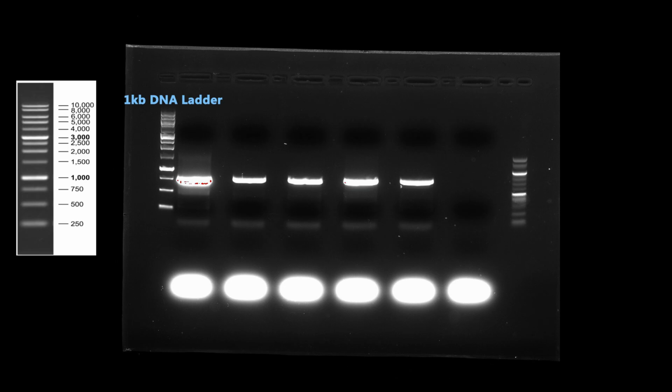This is an example of typical agarose gel electrophoresis results. The DNA ladder at the left will allow you to determine the size of your sample based on predetermined marker sizes. The sample in this example is shown to be around the 750 base pair marker.